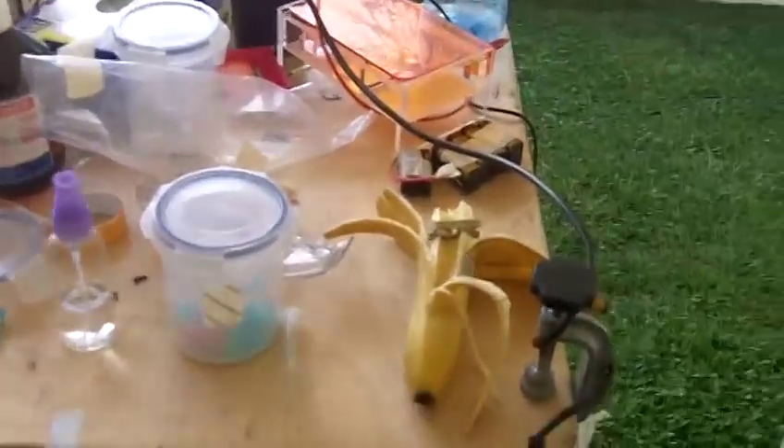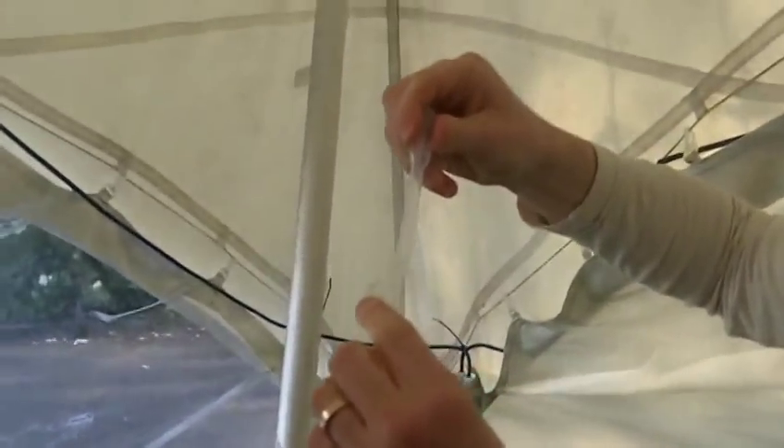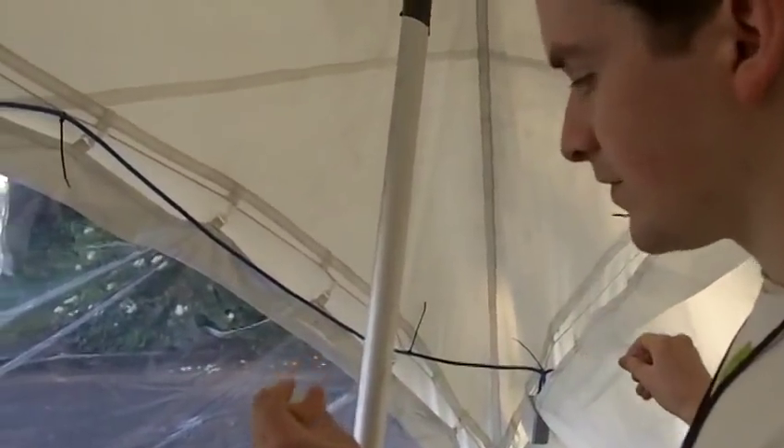We'll use a different coloured tube — that is one of the mindful elements of science that people like myself often forget to do. I was actually able to design and print this thing using a 3D printer called a MakerBot. We have an example of a MakerBot over here in the Tilepackerspace in Dublin. I printed it on my own MakerBot until I had a working prototype, then offered it online as an open source hardware design. You can download the Dremelfuge file and print it for yourself on a MakerBot, a RepRap, or an Ultimaker.